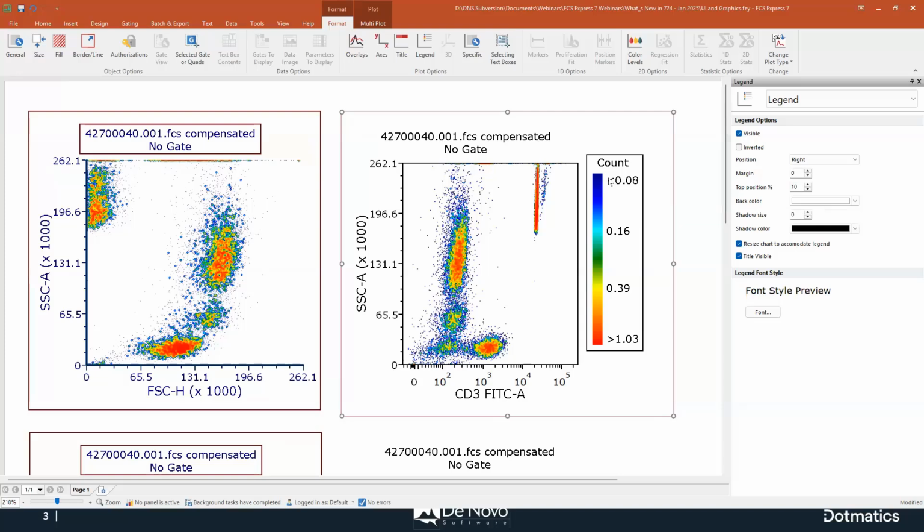The top color is basically the lowest value, and the bottom is the highest. And we realize that indeed this is a little bit counterintuitive. So you might want to use this option: you can invert the shade and also the value.